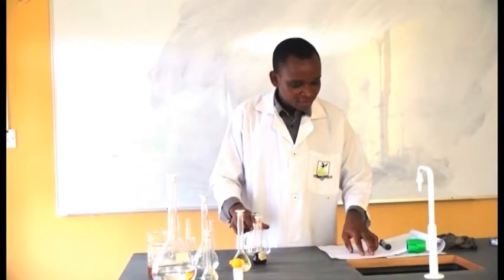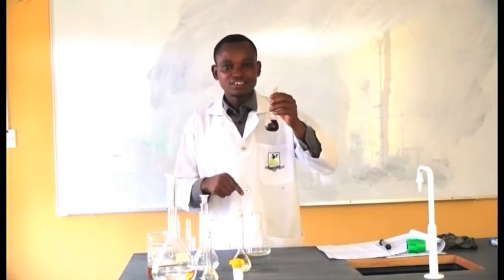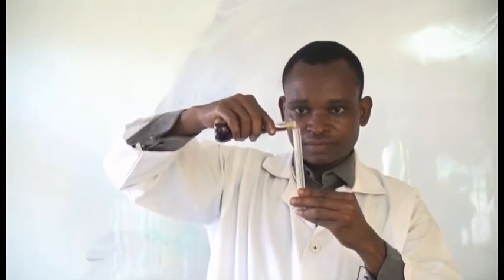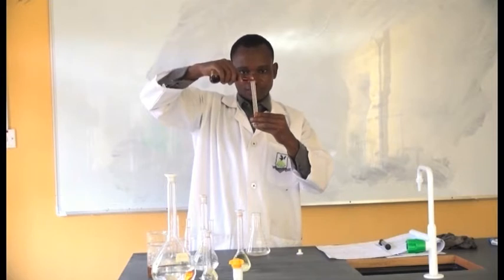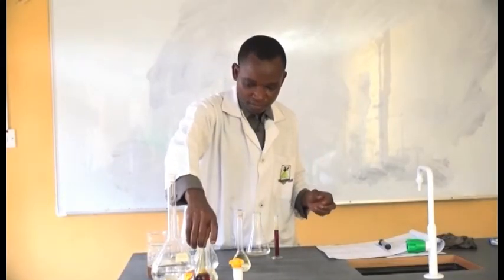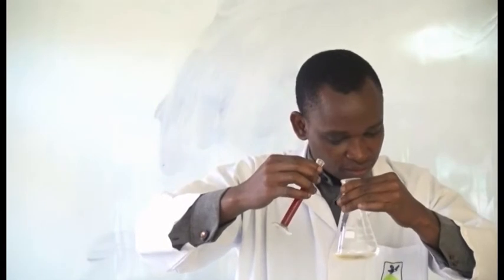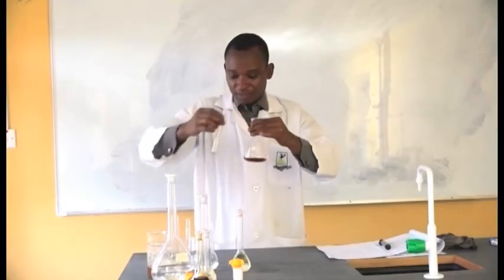The next step says add 10 ml of standard iodine solution. This is our iodine solution. I'm going to add 10 ml of it into the conical flask and shake.